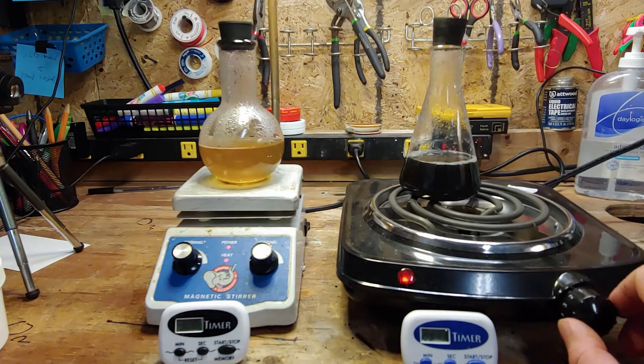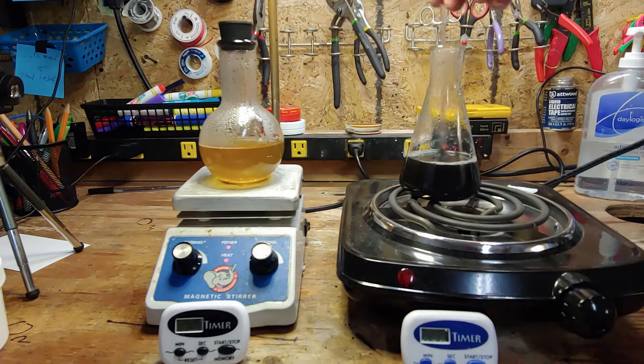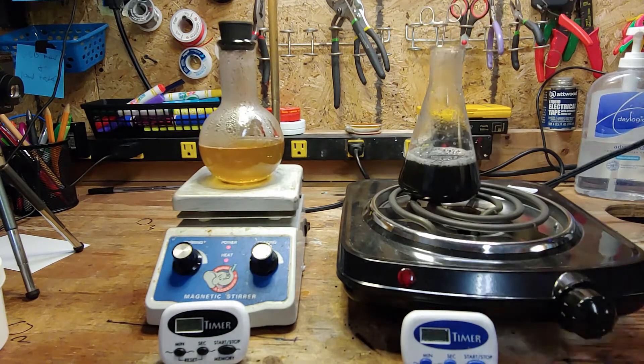It should probably be stated that if your goal is to just grow bacteria, yeasts, or molds, you don't need the malt extract powder. Just follow the mixing directions on your nutrient agar, and carry out the procedure exactly as it is shown.